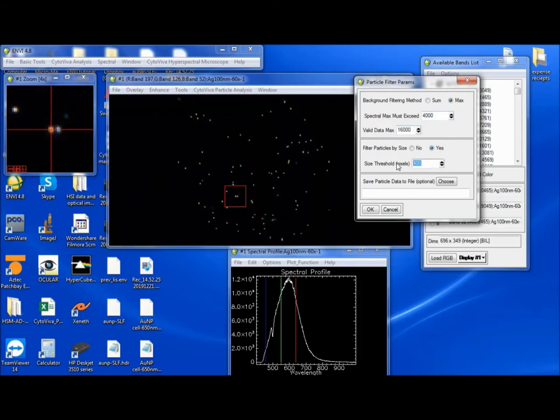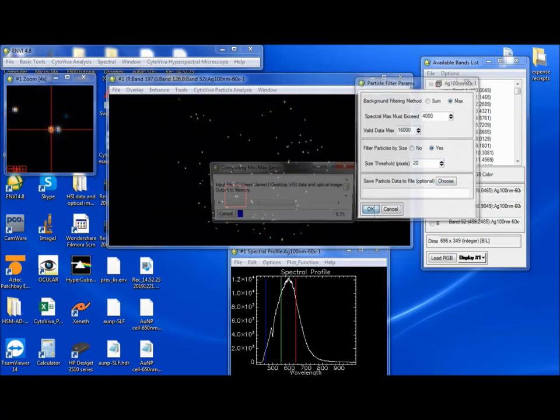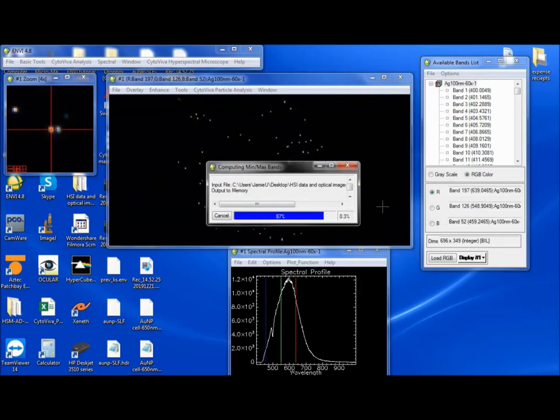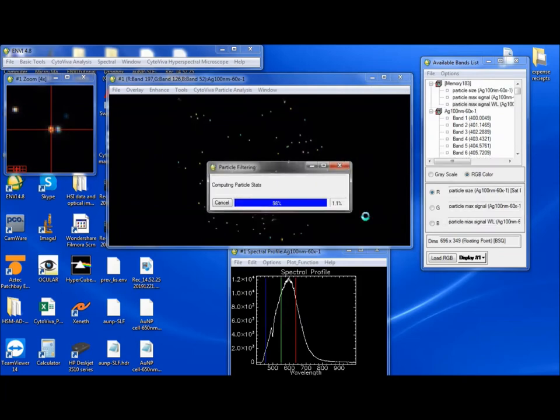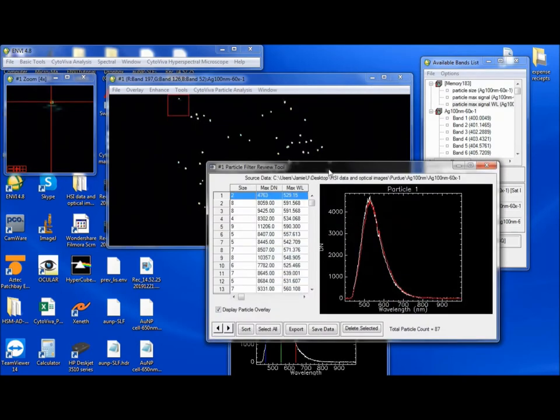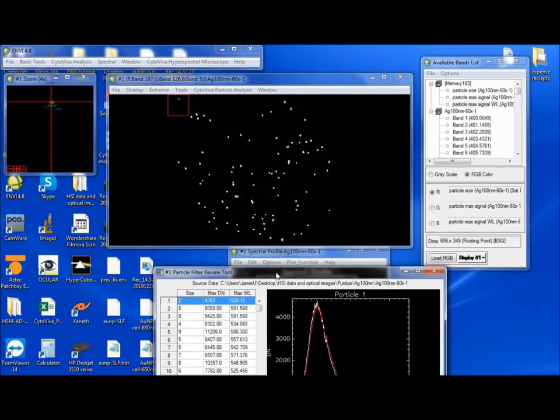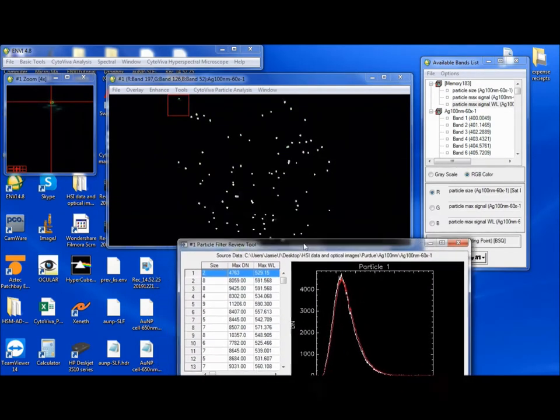So now we have a range. And by size, yes. Let's take this down to 20 pixels, I think. I don't think there will be anything really bigger than that. And we can choose to save this data now, or we can just see what it looks like and then save it afterwards. So you hit OK.